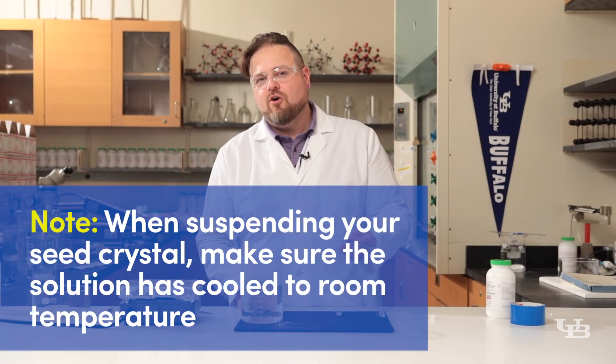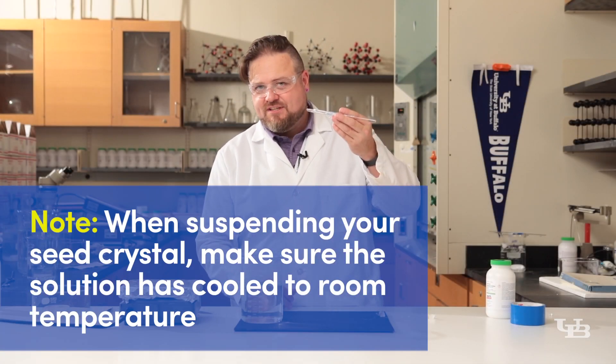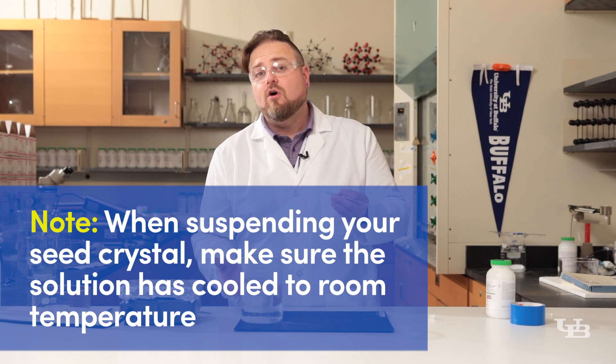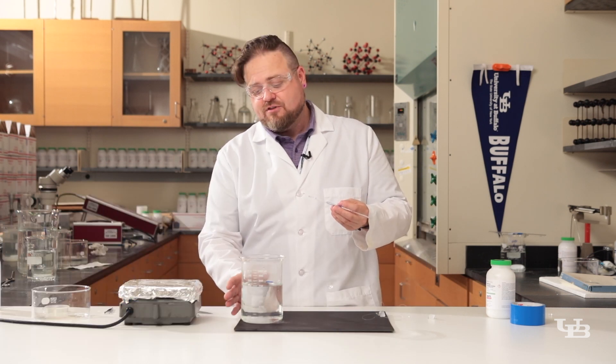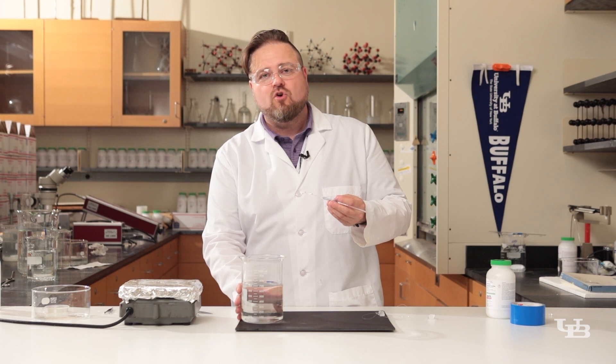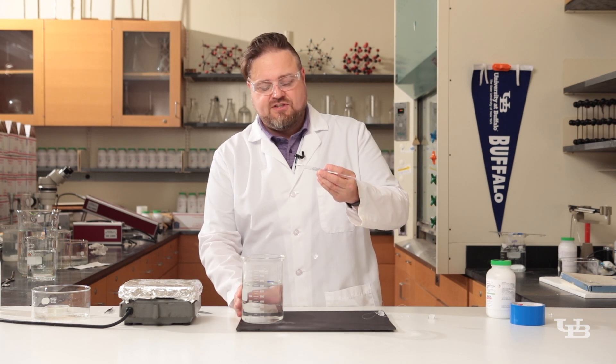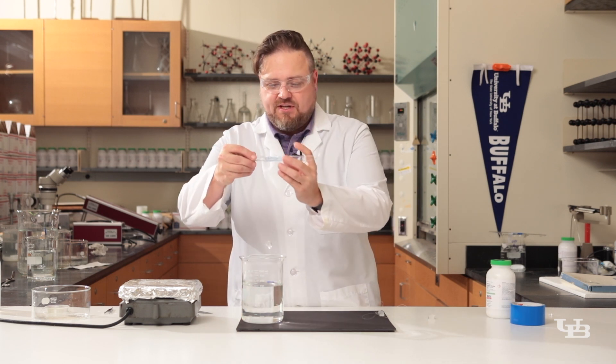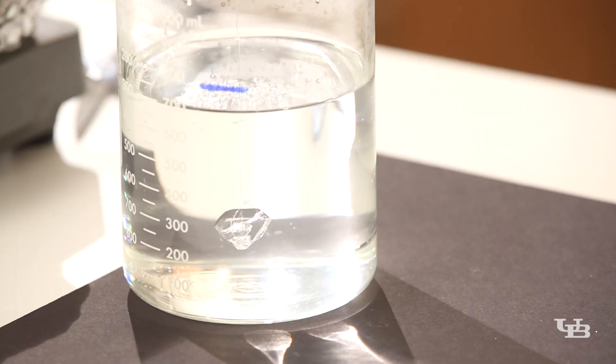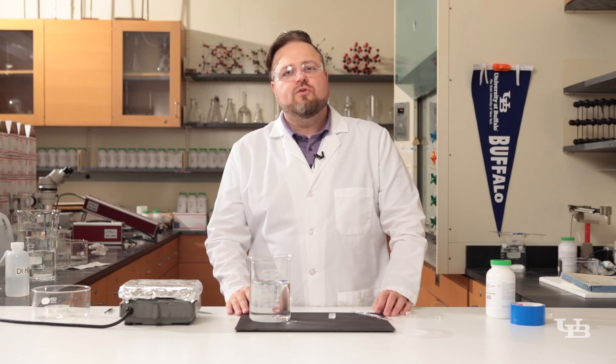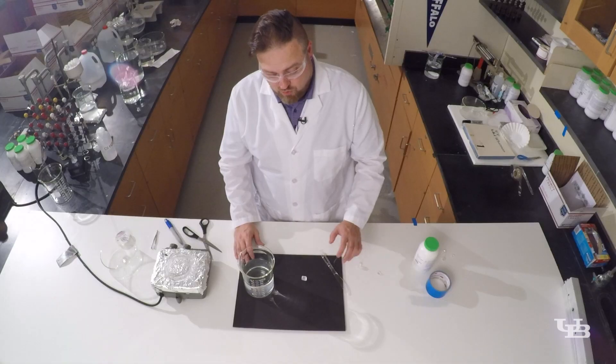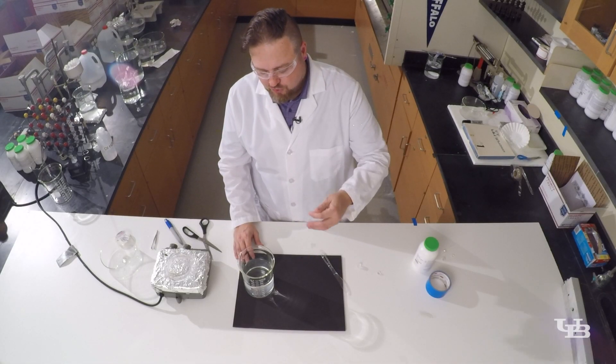One of the things that can go wrong is adding your seed crystal to a warm alum solution. If the solution of alum is warm it's almost certainly going to dissolve your seed crystal. Here is our cooled alum solution to which we want to add our seed crystal.